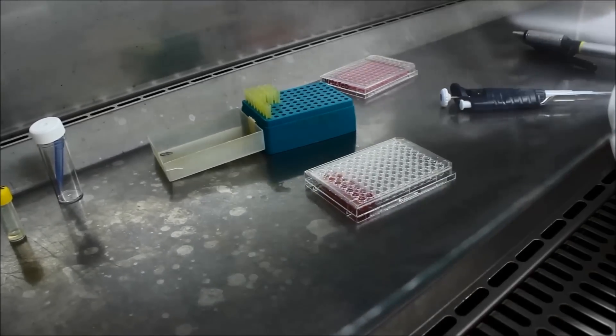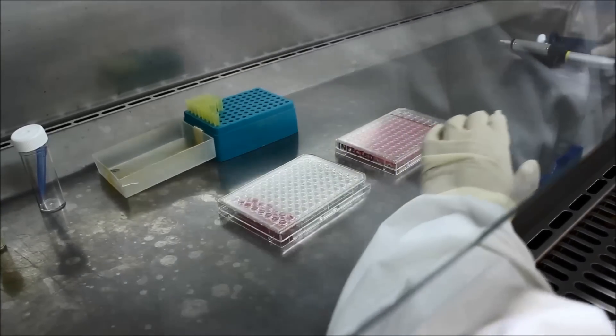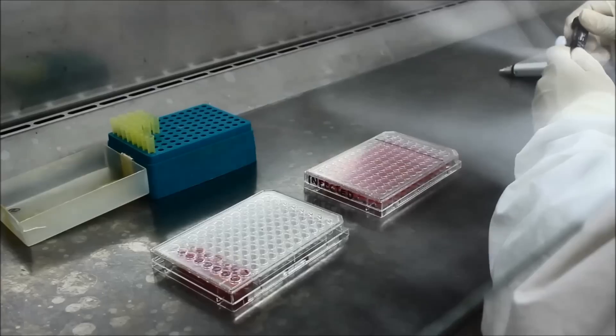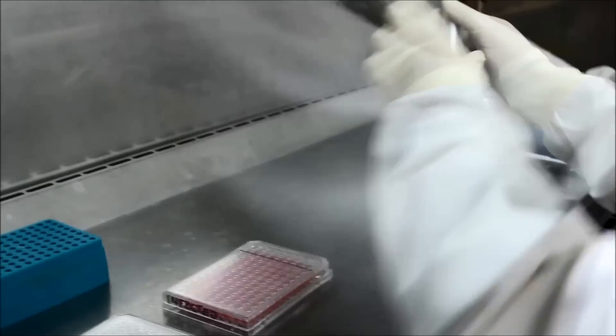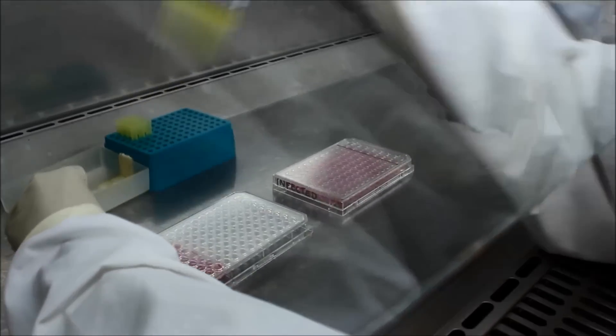Once your dilutions are complete, then add 25 µL of each dilution into the corresponding well on your infected tray as shown. Leave the last two columns for virus-free controls.